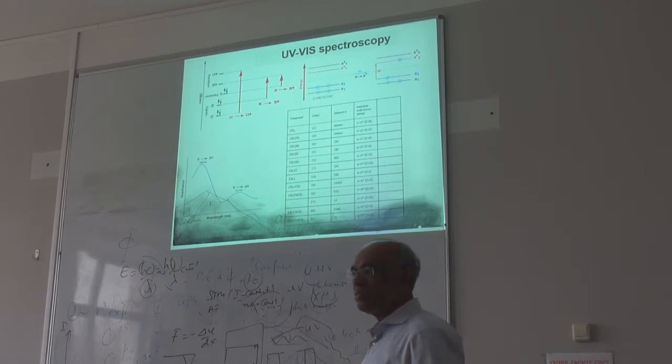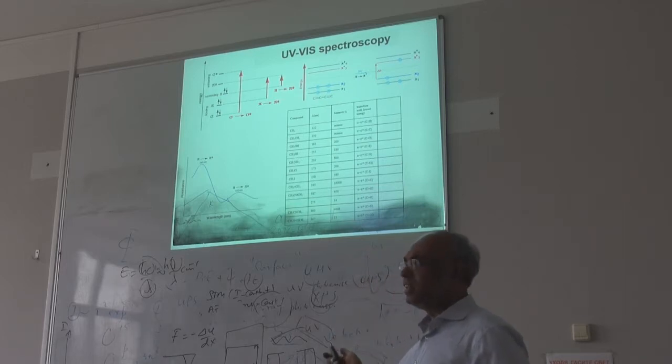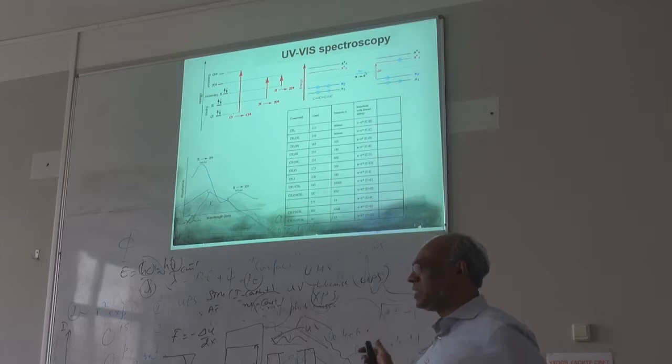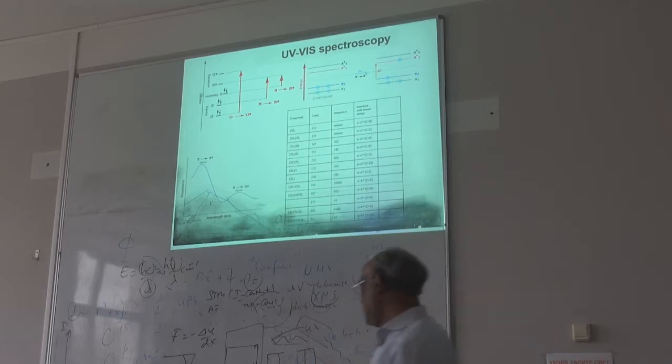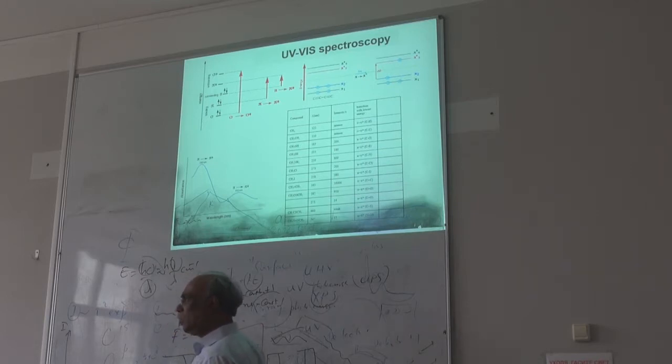So this is the most fundamental spectrometer. It's basically you have your sample, then you have your light coming here, then you have your detector here, and you get the transmitted light. Or if your sample is not transparent, then you have to use the reflective one, right?